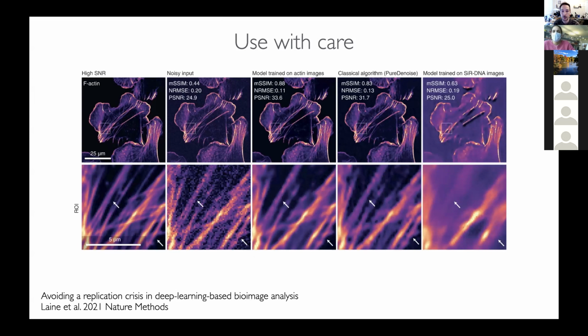And so that's the one thing that you need to have in mind, is taking the effort to annotate data, train a network for exactly what you want. And if you do that and use it in that context, then you'll get very good results and it should be very reliable. And we'll look at how to do that today.